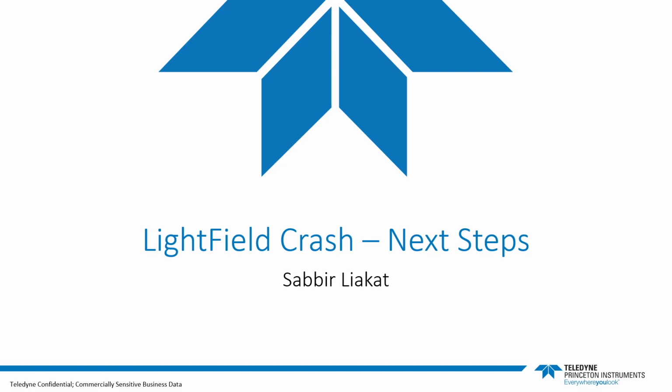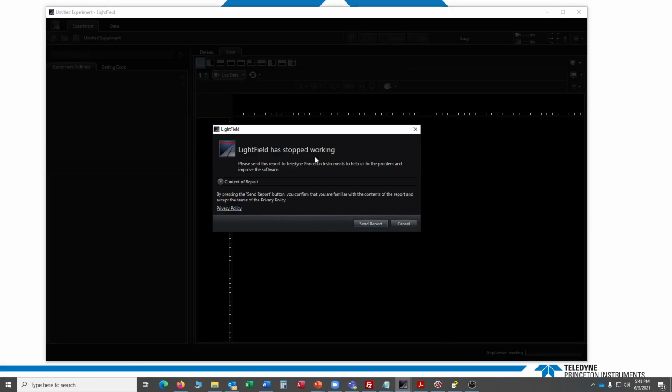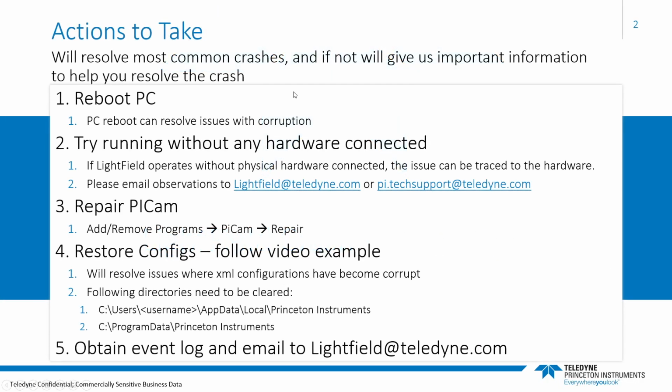We're just going to go through some next steps if you get a LightField crash. So if you have this not fun "LightField has stopped working" crash, don't worry, we're here to help. We'll help you get running. So here are some next steps you can take. This will resolve most common crashes, and if not, it's going to give us important information to help you resolve the crash. So first is rebooting the PC, okay?